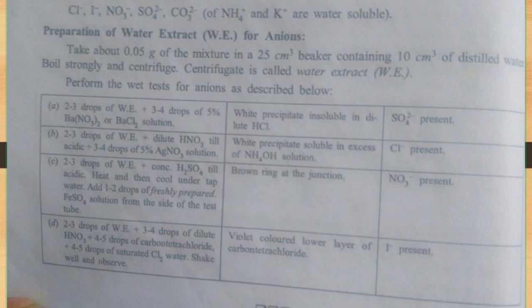So accordingly, you have to check carefully which is the major salt. If it is calcium chloride, then chloride ion is not the impurity anion. Impurity anion will be different from chloride. If the major salt is magnesium nitrate, then that doesn't mean nitrate is the impurity anion. Impurity anion will be different from nitrate. So accordingly, one should be very careful while detecting impurity anion.